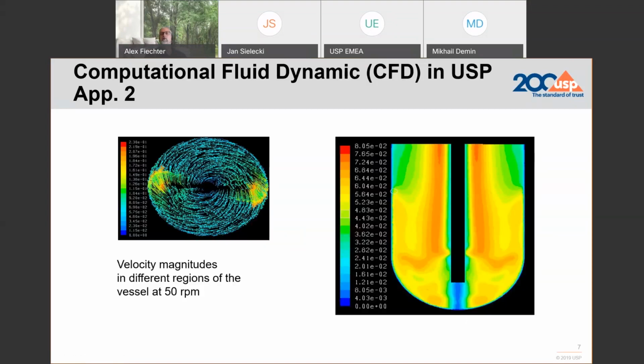You want a reproducible surface area throughout the whole 6 vessel assembly to be able to have controlled release of the specimen in place and be able to extract any variability that may come from the surface area that is produced by this peak.